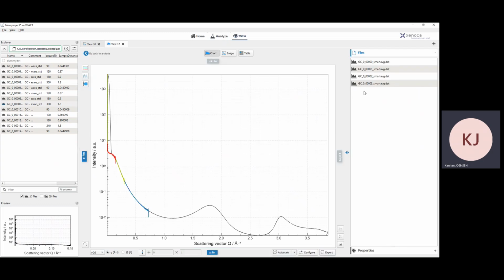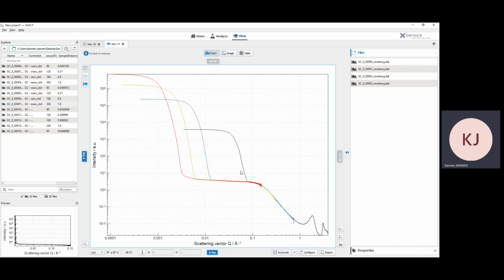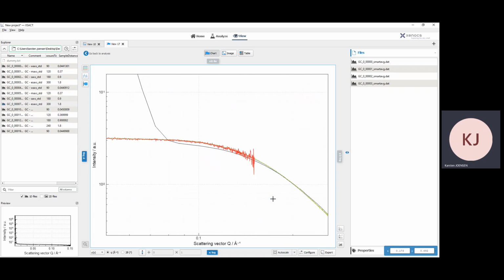All right, now we have these, which are the average versions of all of these, and we'll go here to the auto scale function of this. Now, one of the things that I would like to show here is if we just zoom in on this image right there, there's a pretty perfect overlay with everything except right in here.